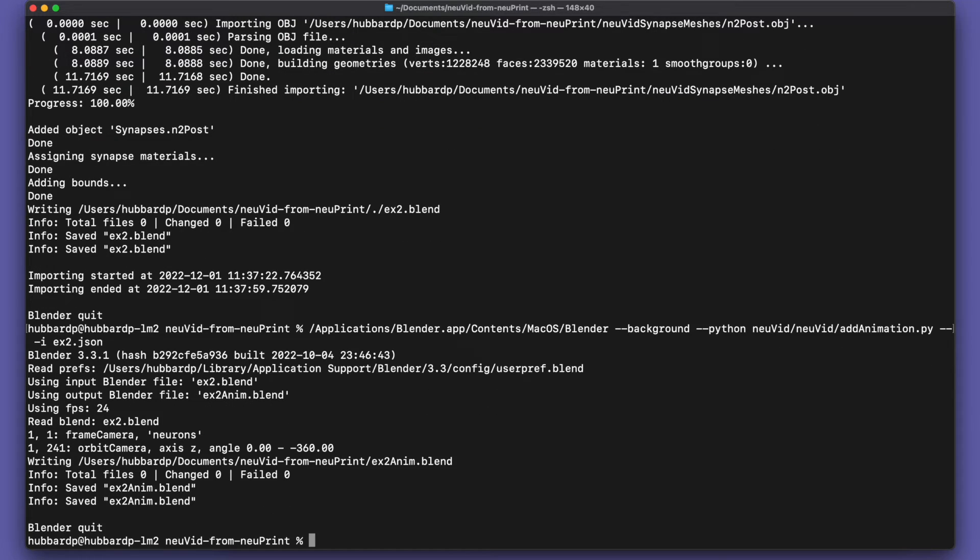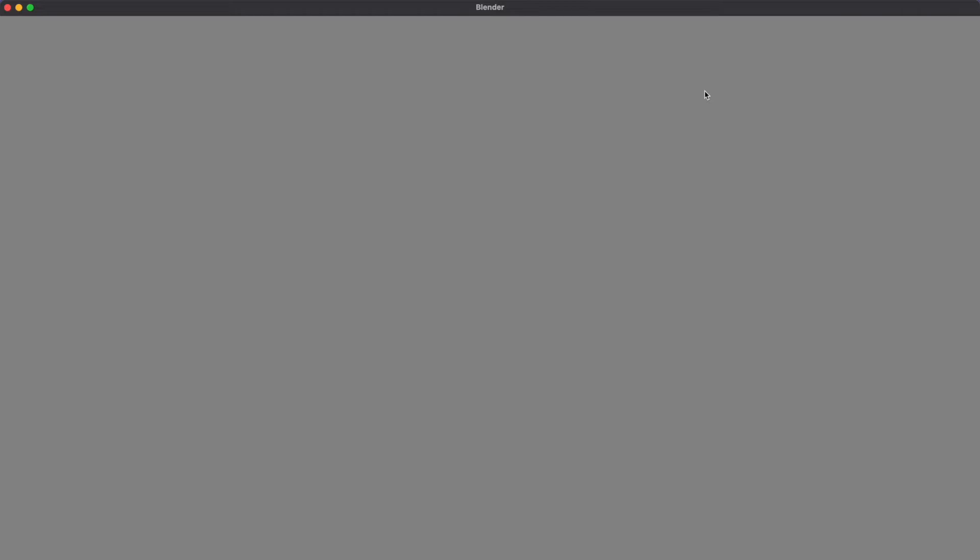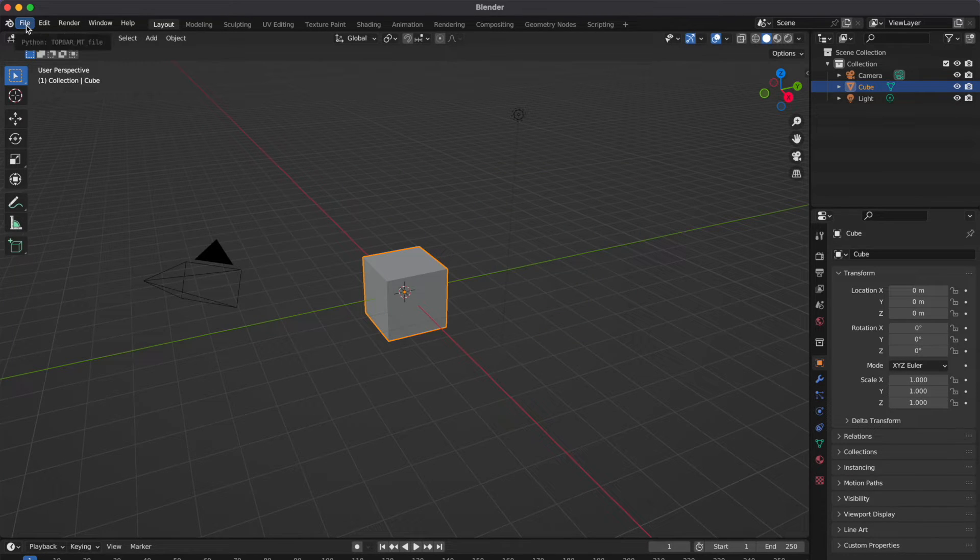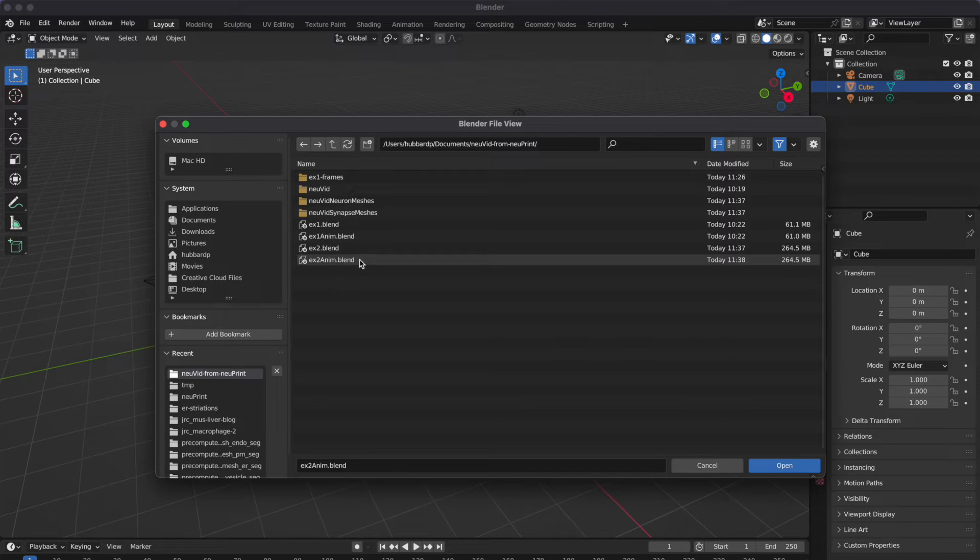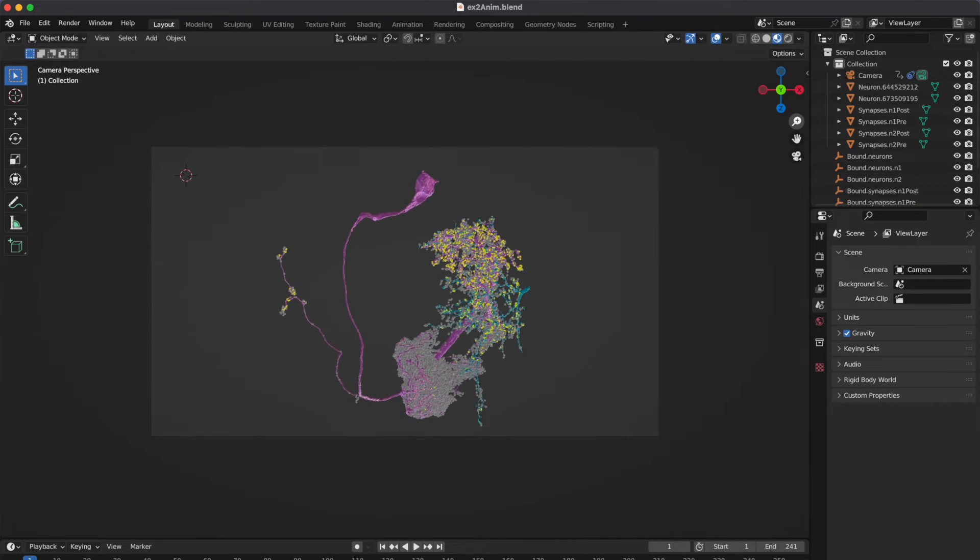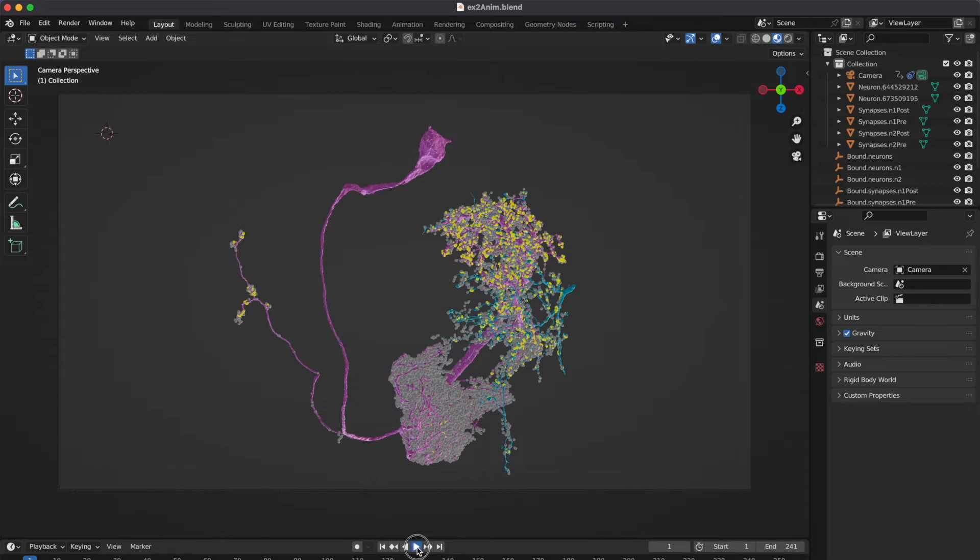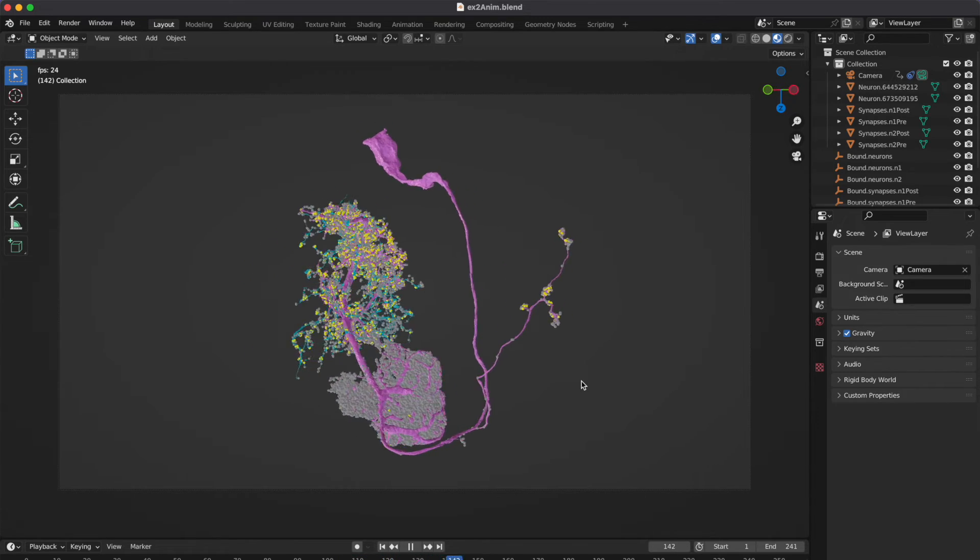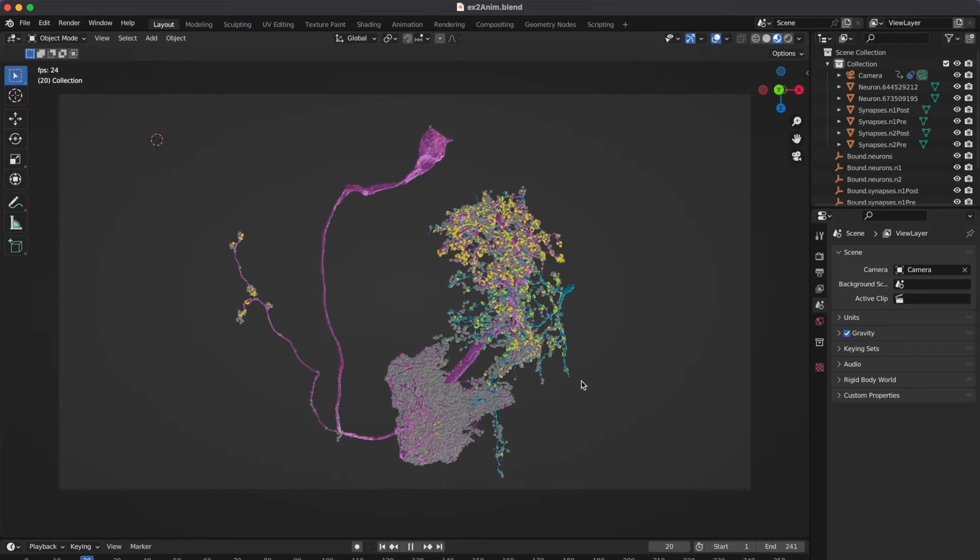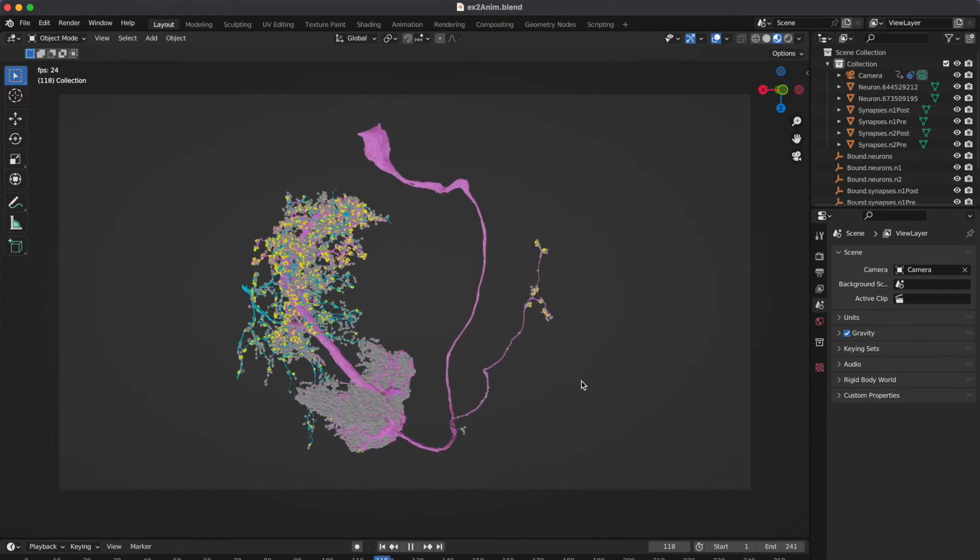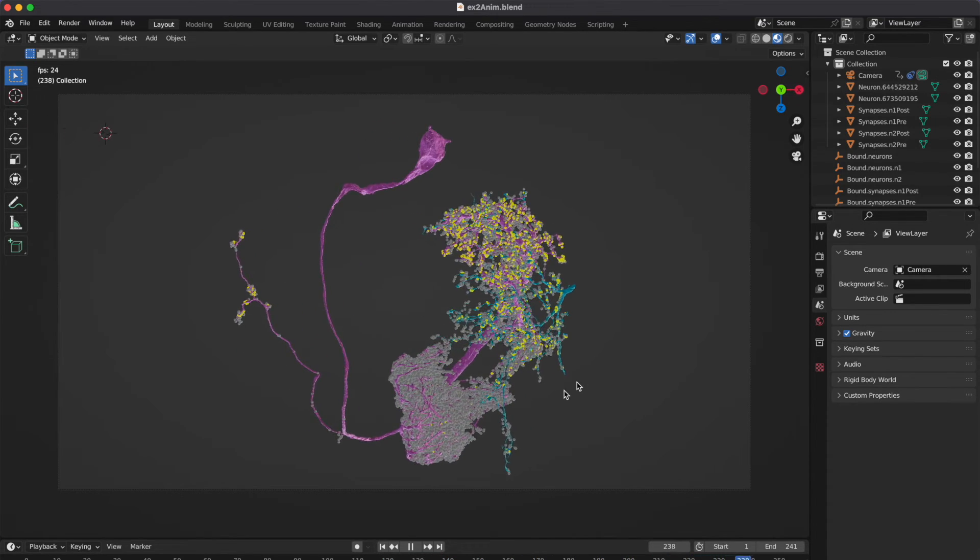Now before we render this, let's take a look at it in the interactive Blender application so we can see what we have. So we can launch Blender and load. It's this example to animation blend file that we want to look at. That's what got created by the add animation. And zoom in a little bit. So we see some interesting stuff here, but it's also a little bit crowded. There are more synapses than we want to see. And we don't have any staging. Everything is visible all at once rather than having things come on progressively one after another. It should make it easier to see what's going on. So let's fix that.